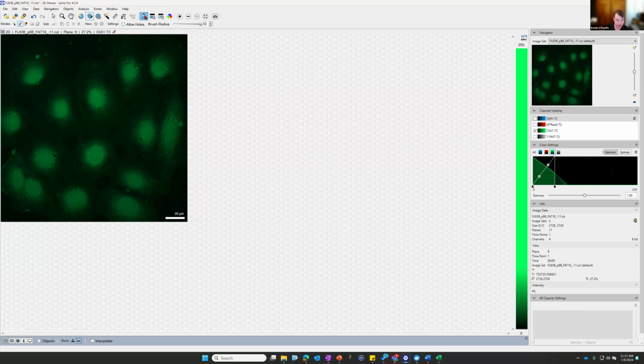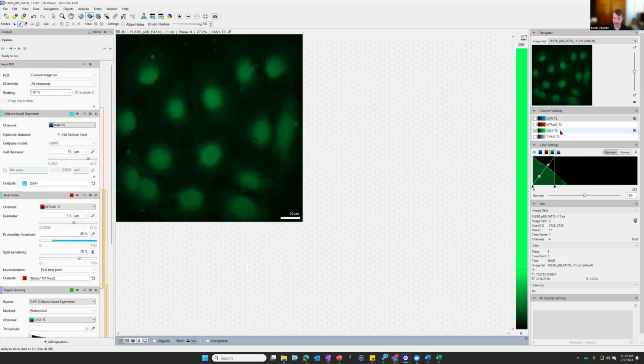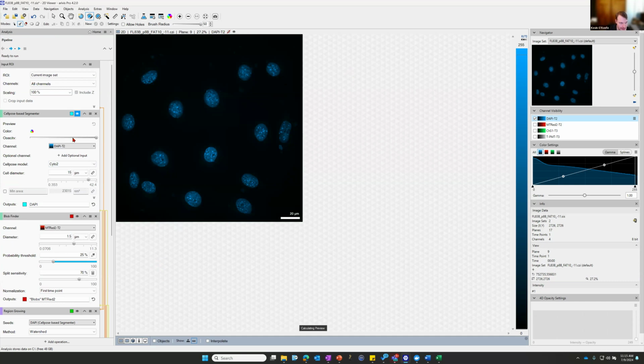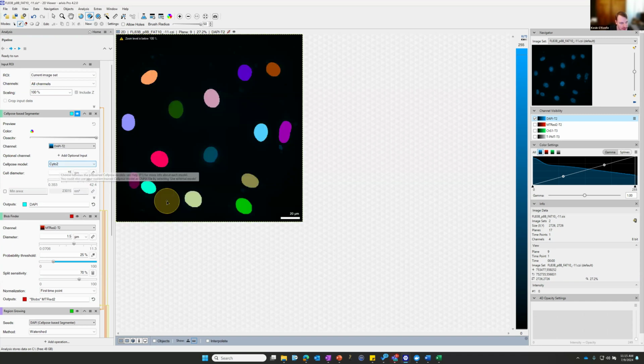Maybe I can show you. Yeah, I use it here. So what I've done here is, you put CellPose in here. You pick the model that you want it to train off of. So in this case, it's a Cyto2 model. We have a CP model, CPX, Cyto2 nuclei. And then this external model is if you wanted to create your own custom CellPose model. And then you're really just giving it the size of the cell diameter, a little bit of smoothing.